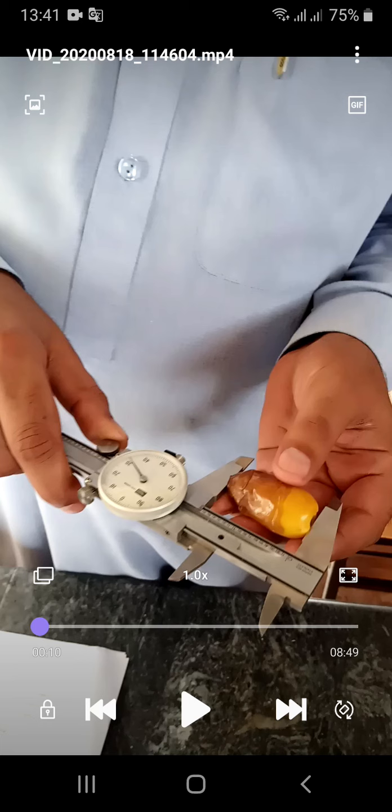Today we have a sample of dates with us. Here you can see in this video that we will be finding the length of the dates by the help of a vernier caliper. This is how we can find the length of the dates.